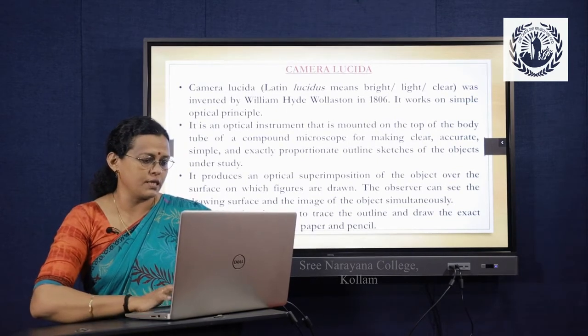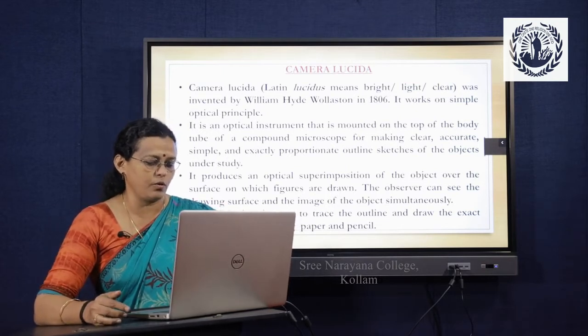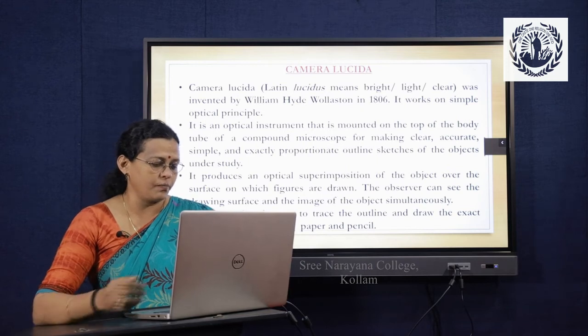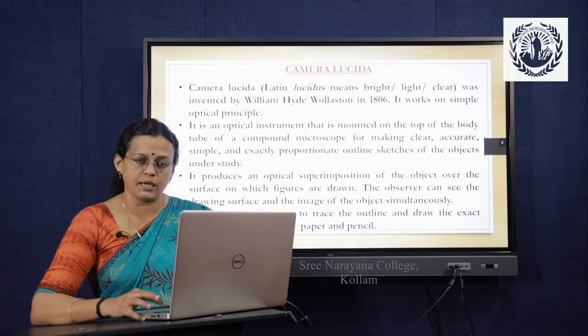So it produces an optical superimposition of the object over the surface on which figures are drawn. The observer can see the drawing surface and the image of the object simultaneously. That is a peculiarity of using this instrument. It enables the observer to trace the outline and draw the exact view of the image using paper and pencil.